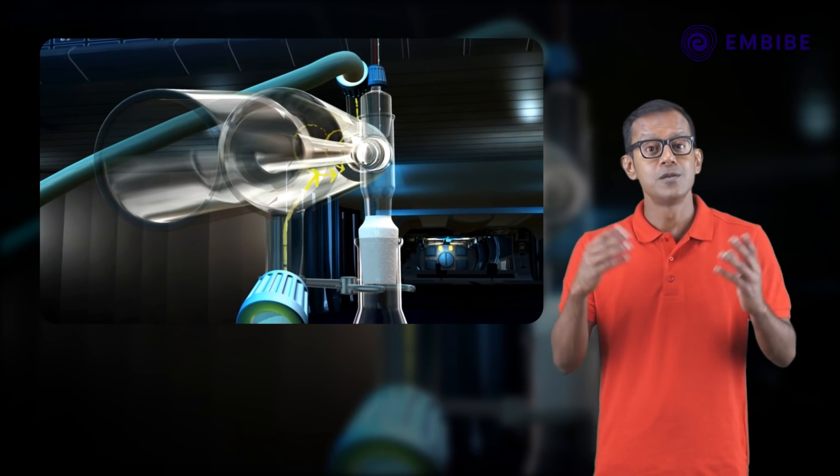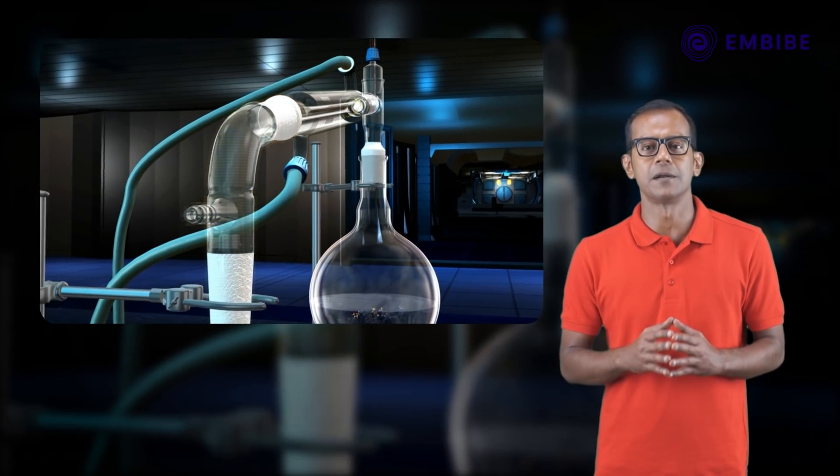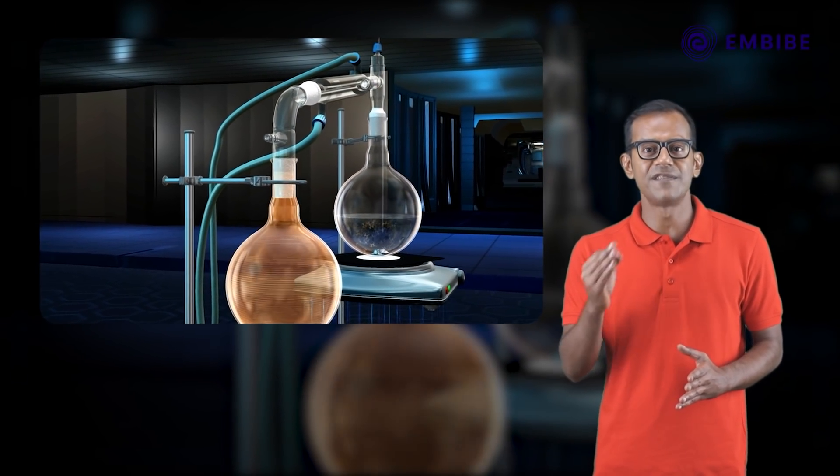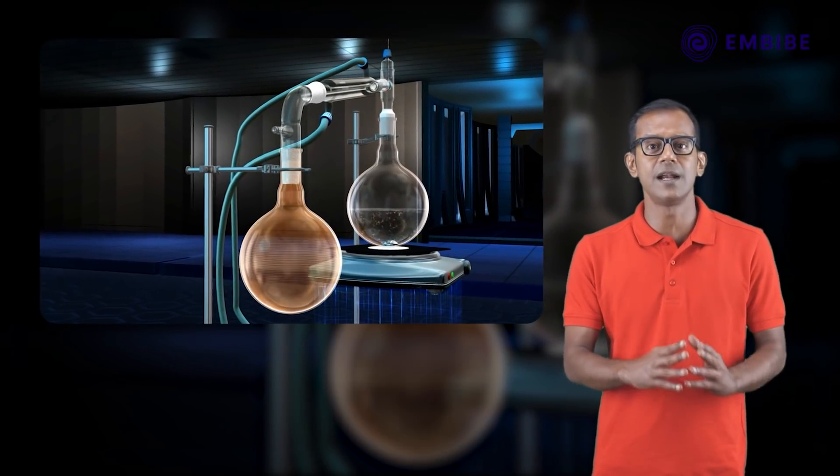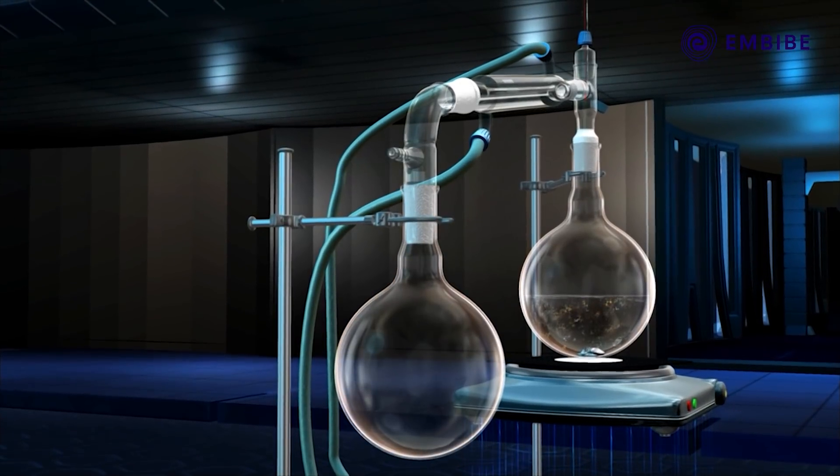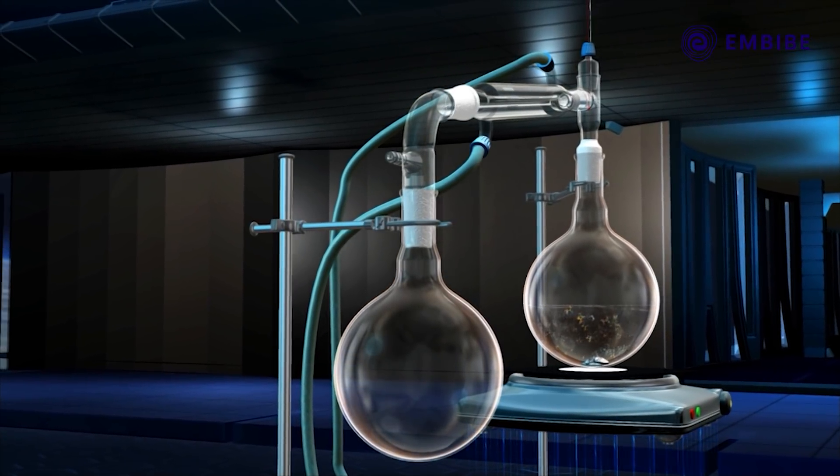The condenser tube has an inlet that lets cold water in and an outlet from which this water escapes. Join the other end of the condenser to a vacuum adapter. Now attach another RB flask, called the receiving flask, to the other end of the vacuum adapter.